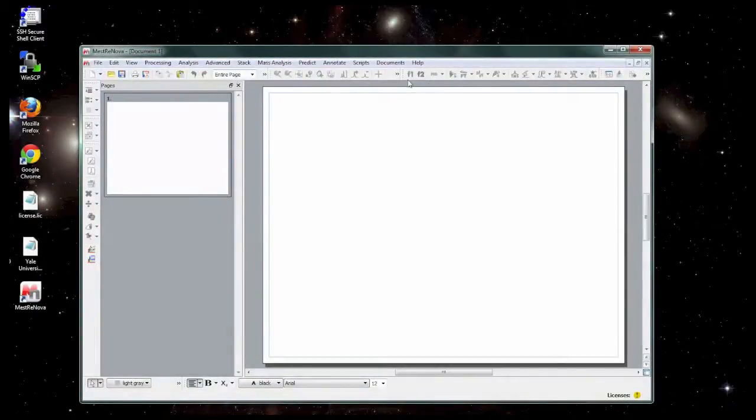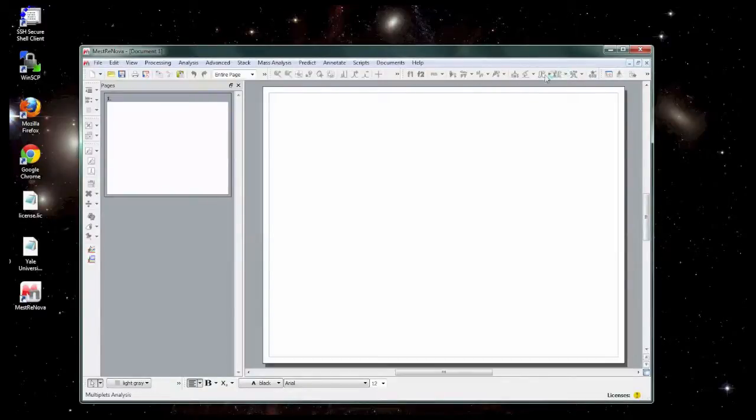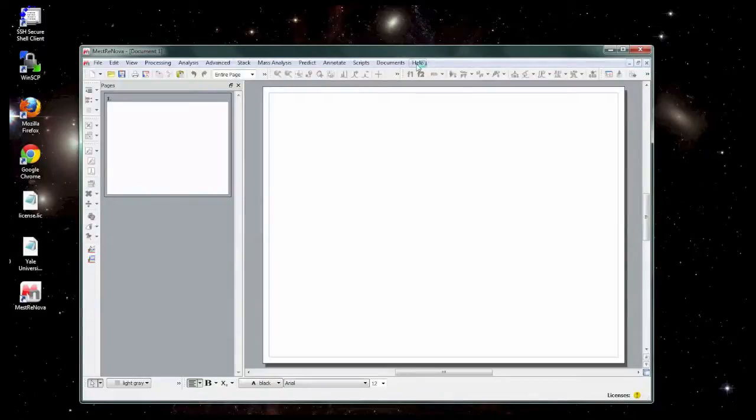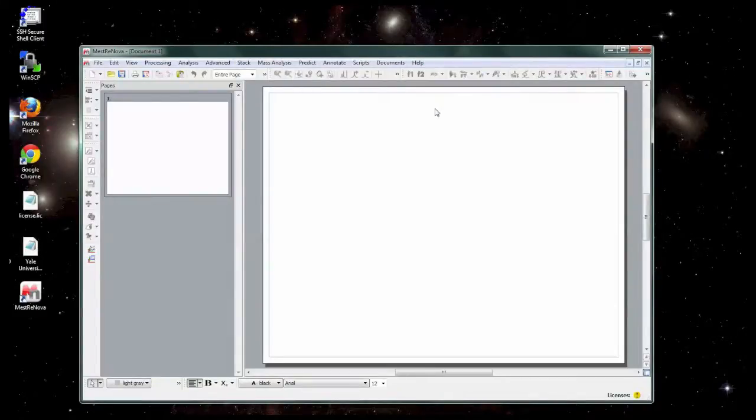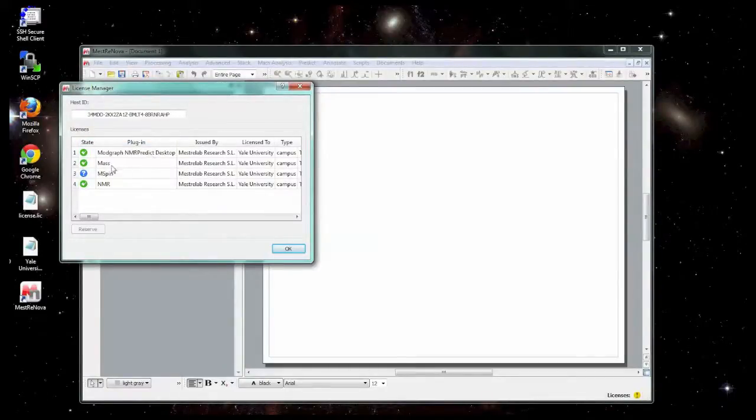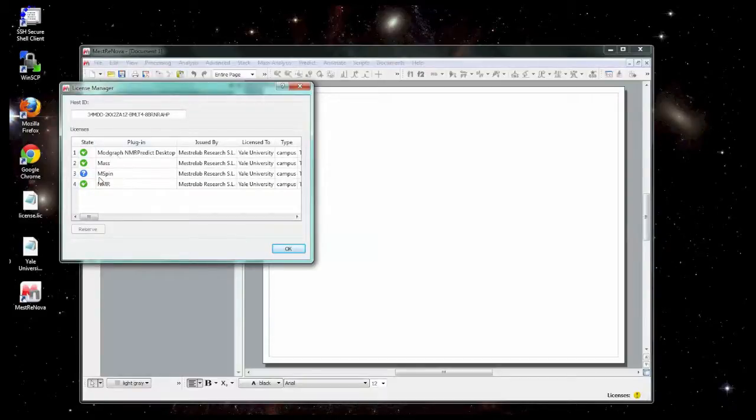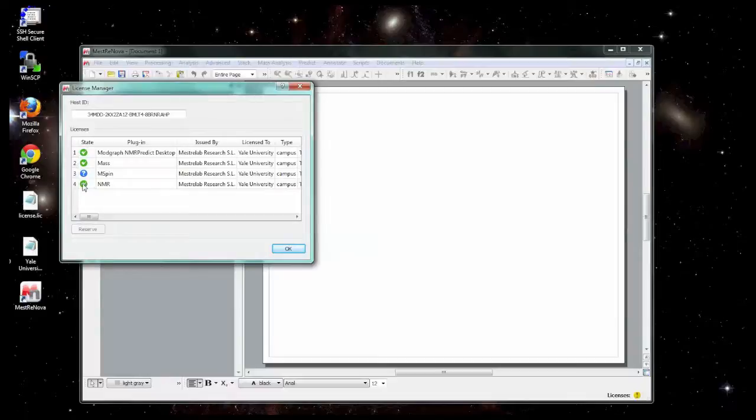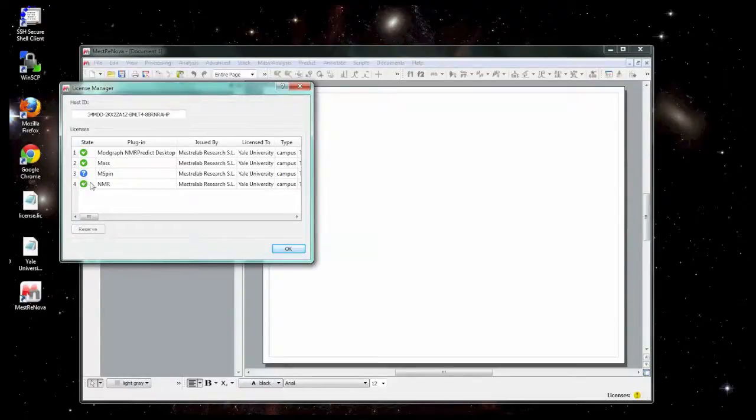If it's working, you should see a lot of toolbars here that will allow you to process and analyze your data. Another way to check whether it's working is you can go to help and go to license manager. You should see the status of the licenses. Don't worry if the prediction or the mass spec or other plugins are not working. But the one you need is the NMR plugin and it should have a green check mark next to it. If it has an X, this means it has not successfully been activated and you need to try the process again.